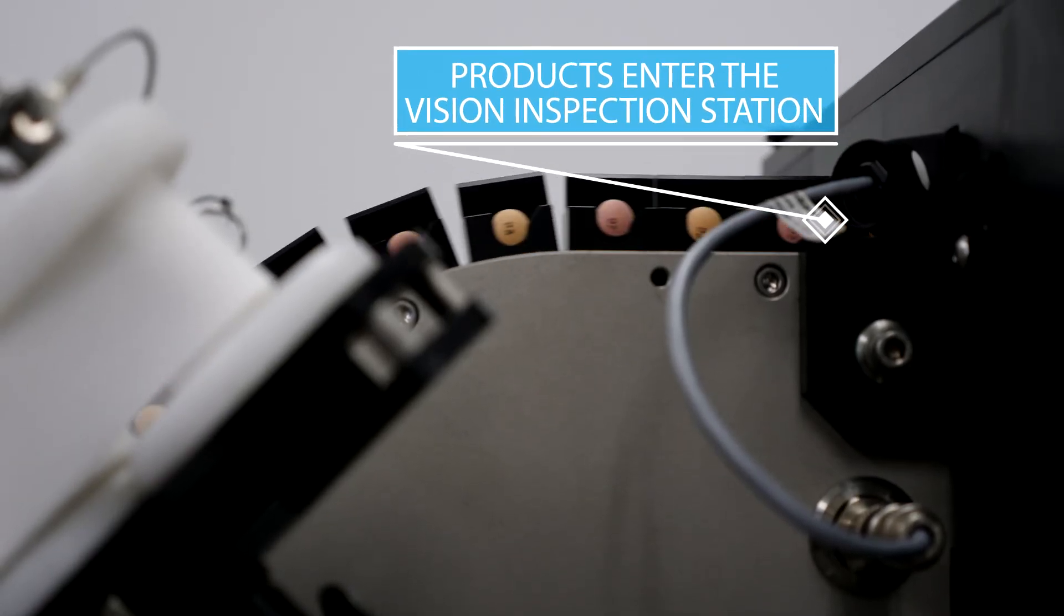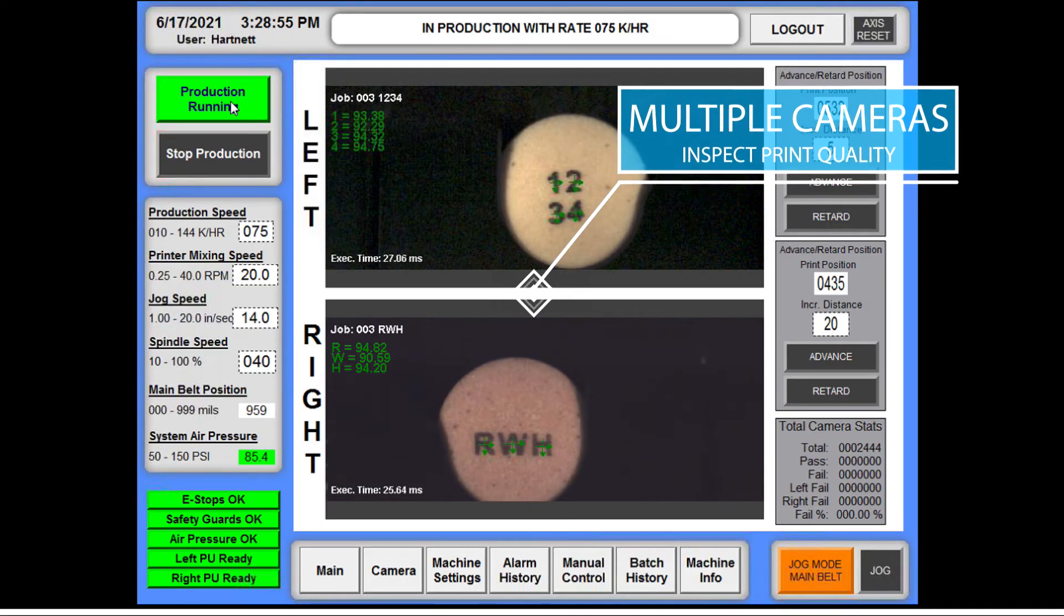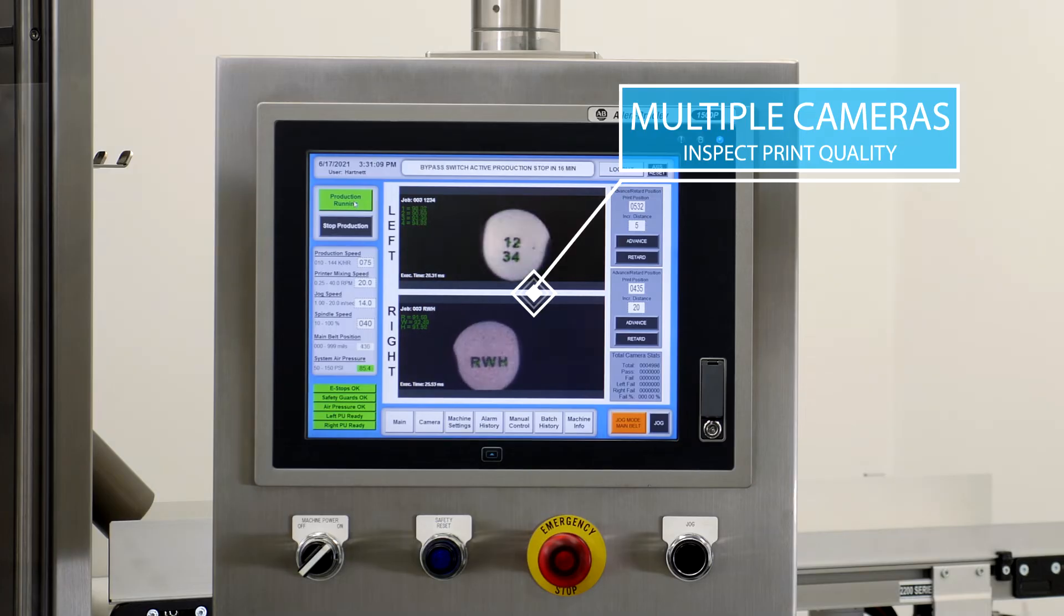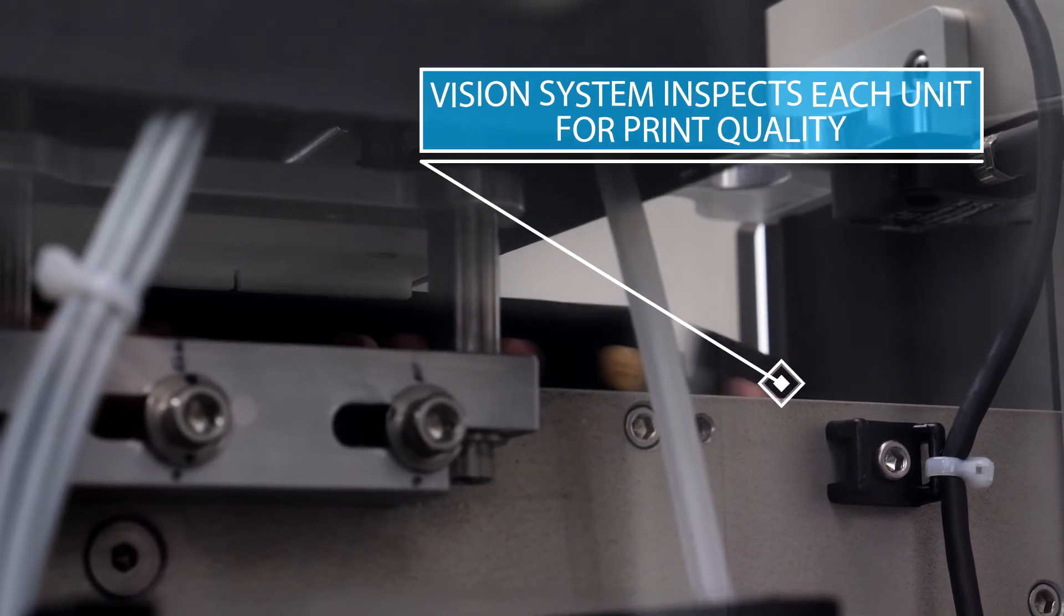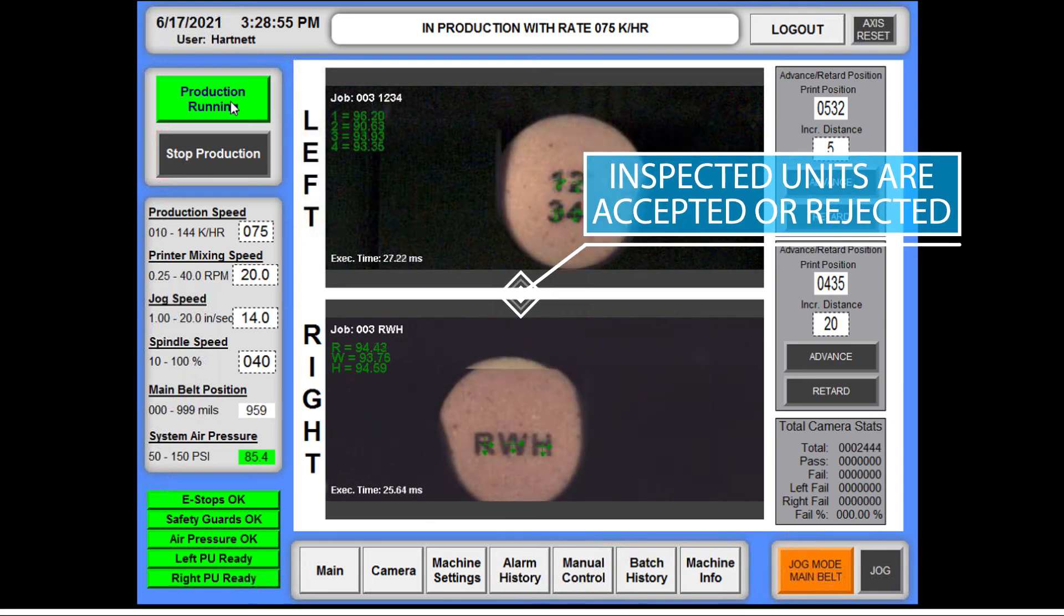After printing, the product is carried to the vision inspection system, which scans characters, trademarks, or logos that are printed on the tablet or capsule. Any product that does not meet our high-quality standards is filtered out through our single tablet rejection system.